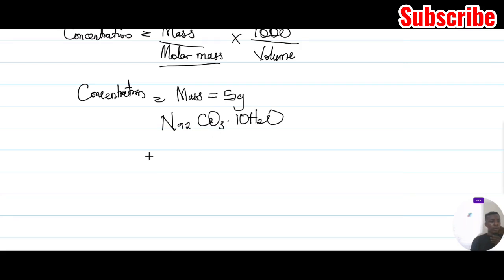Na2CO3.10H2O. Alright, the mass of sodium is 23 times 2, you should have 46, plus carbon is 12, plus oxygen is 16 times 3, you have 48.